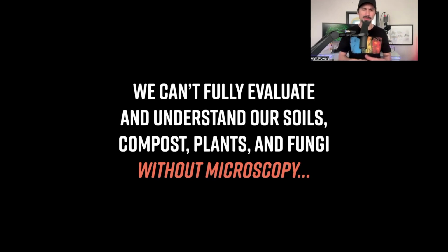And also, if you have been to any of my talks where I talk about horizontal gene transfer, you know that even just looking at the microscope under the light, they're doing horizontal gene transfer and exchanging genes in response to their environment and adapting, changing their actual genes. So over the course of a day or two of attacking the bacteria and fungi in the soil, you have to break them up to break the DNA up to look at the DNA.